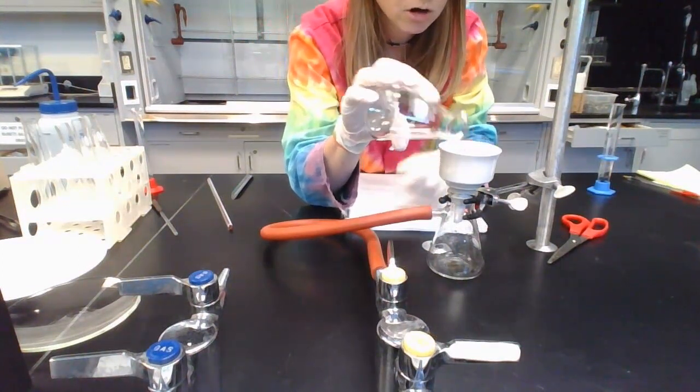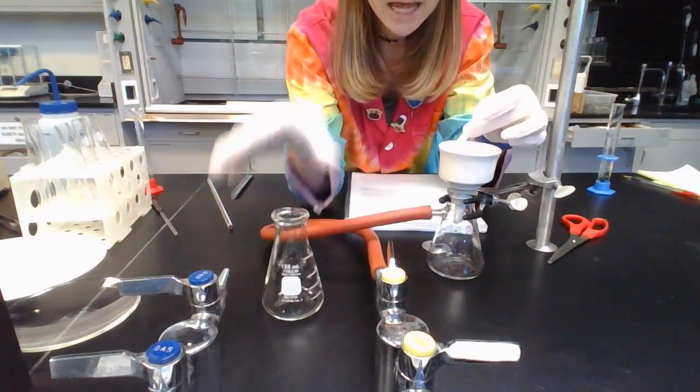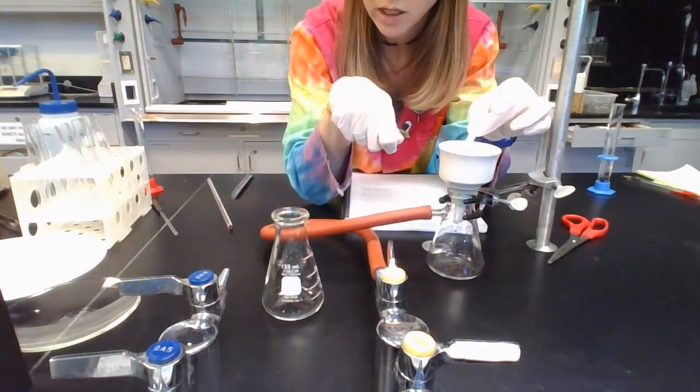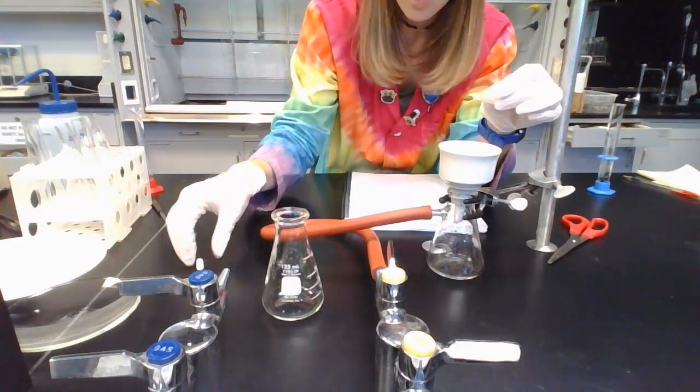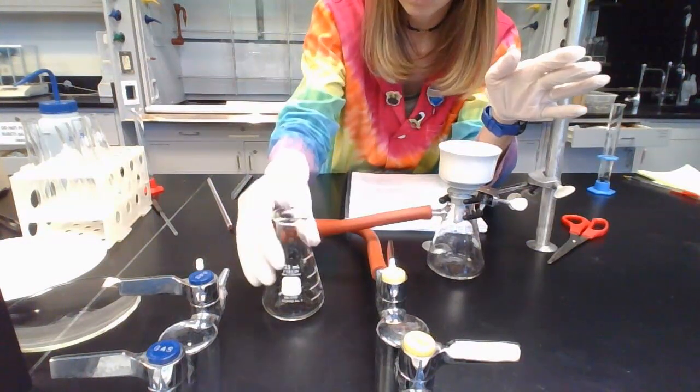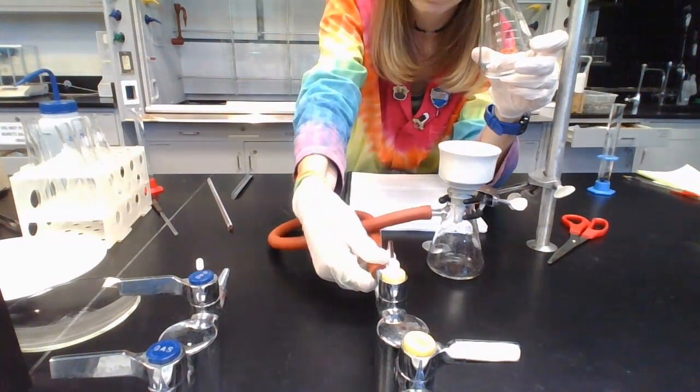Now be careful with the stir bar. Like when the stir bar comes out, you're going to want to get that out of there. But you're going to need to rinse that with that nice cold ice water that you had before. Rinse it to get all the solid crystals off, okay? And then once it's rinsed, what happens is there's still going to be solid in here. So you're going to shut it off.